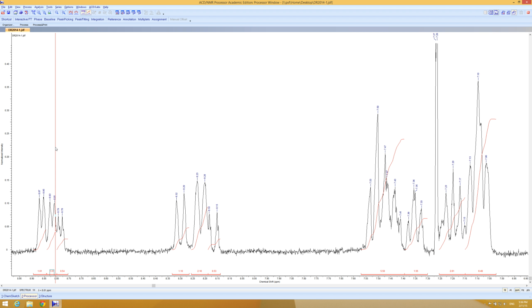So I guess we can have a chat about this individually when you start trickling in your drafts, but quickly, what you'll see is that this should be 1 proton. This should be 1 doublet, not 2. Certainly not 3. I mean, it could be 3 in principle. And based on what you know about symmetry of the overall complex, you should be able to make a decision as to what isomer this structure is.